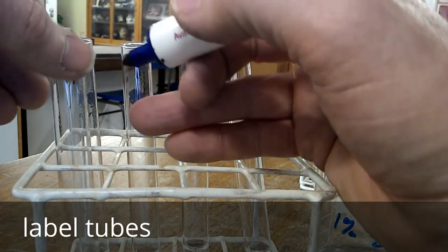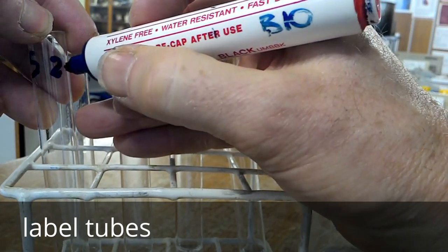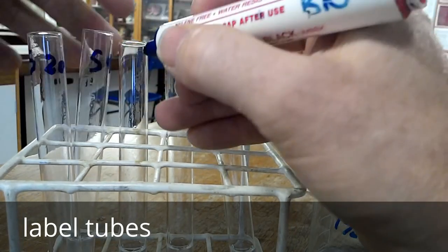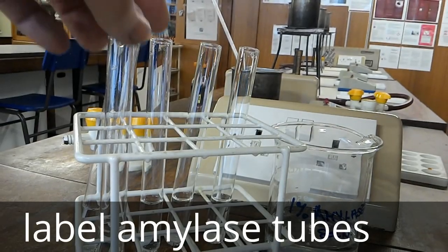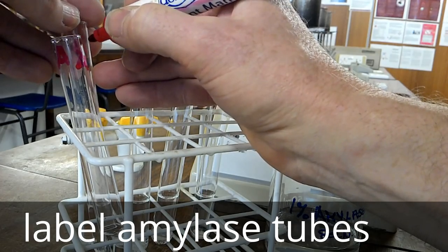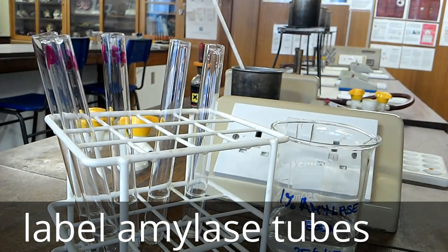You need to label each of your starch tubes at the top with an S for starch and a temperature. So I've got an S20, an S for the next one 40, etc. Now label your amylase ones, so I'm going to label them A, and we've got one at 20 degrees, A at 40 degrees, A at 50 degrees, amylase ones, etc.